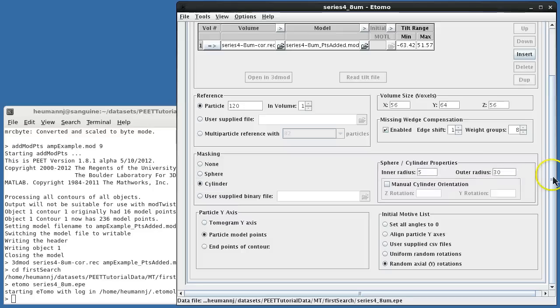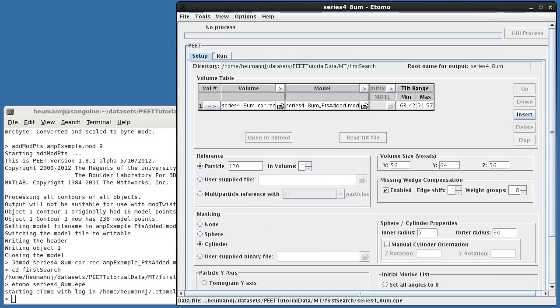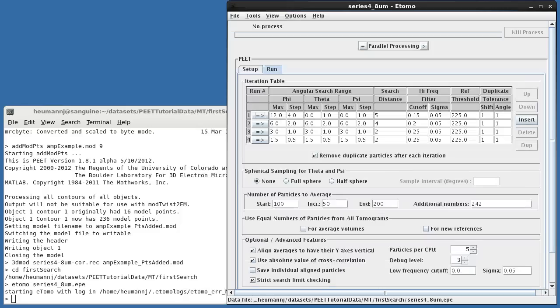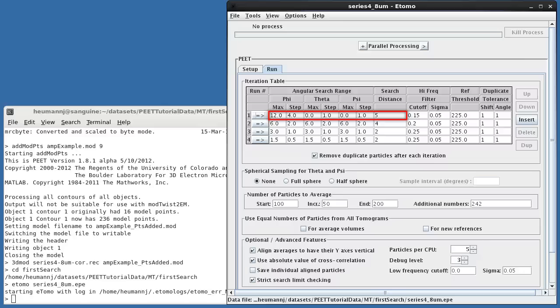On the Run tab, you can see that at the first iteration, I've specified a limited-range 24-degree search about the microtubule axis only. This is appropriate for a 15-protofilament microtubule with helical symmetry. Of course, with an unknown structure, you may have to try multiple search strategies and point spacings before finding an appropriate one.